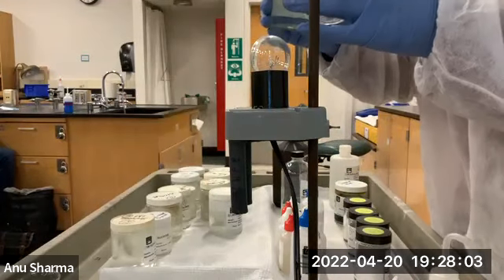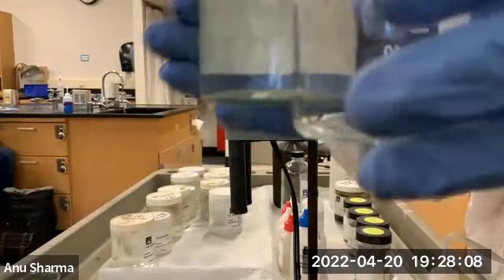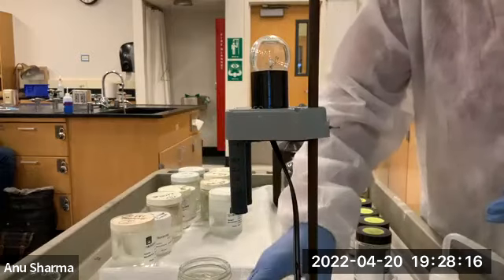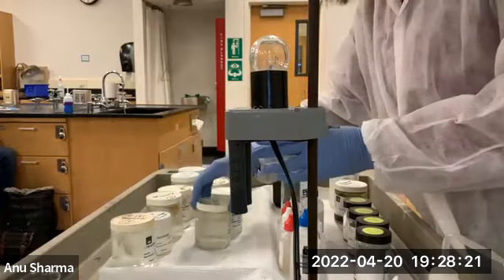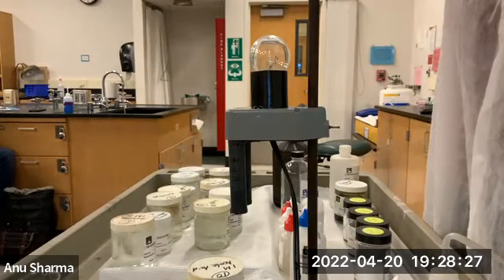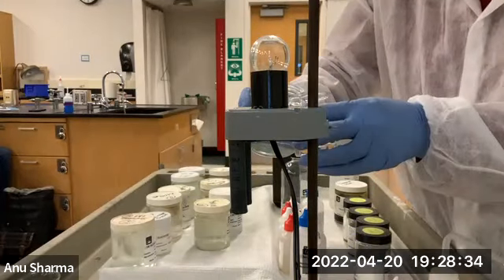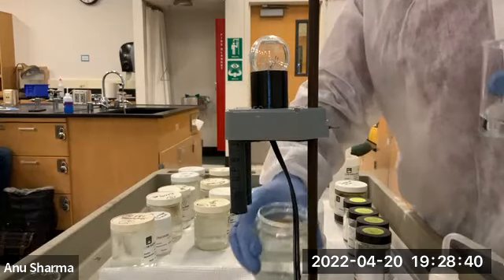Okay, so here I'm putting in some amount of ammonia in this. Okay, so let's just do this. That was a lot, but it's fine. Okay, so here is ammonia, and we have to mix it with the acetic acid. Ideally, if you really want to run the reactions, you should do the calculations, how much of each you need and so forth. But since we are just demonstrating, now that's ammonia.